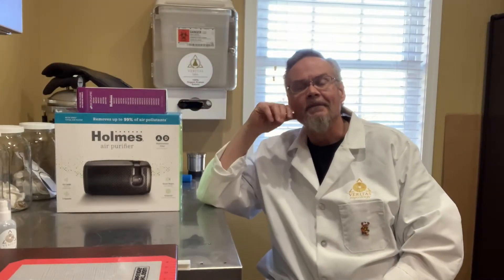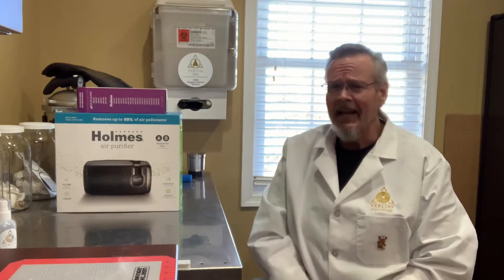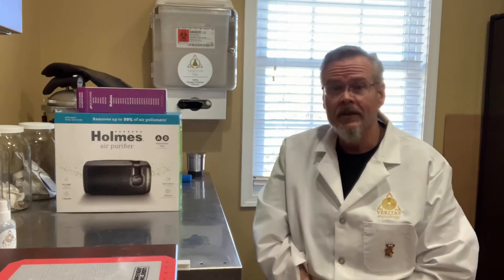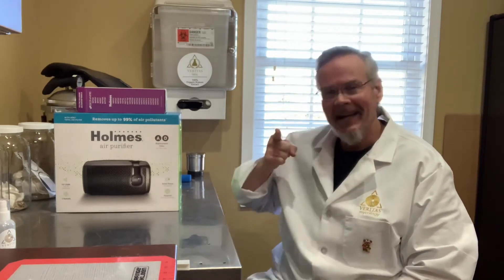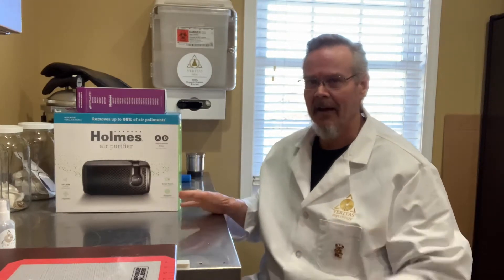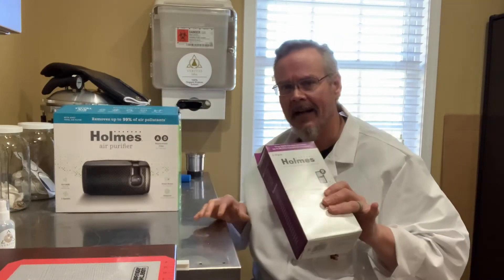Hey guys, it's Dan from Veritas Mycology. How's everybody today? Long time no see, right? I have been busy. We've got a lot of things going on here at the lab, but one thing we've noticed is that you guys really like that low-tech fluid. I've had a lot of questions about what particular kind of stuff that it was. People couldn't actually find that particular one, so I went out and bought a new one for you guys to check out.